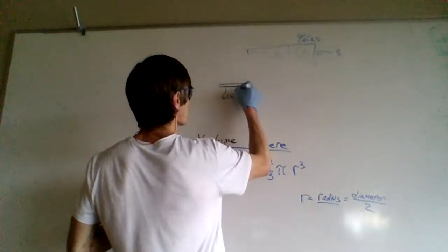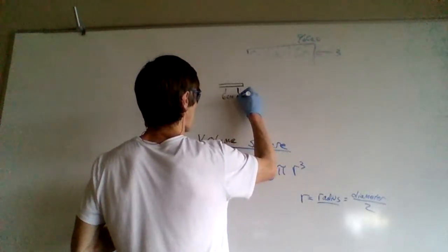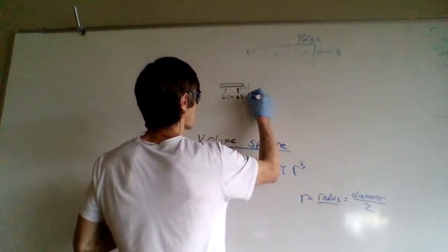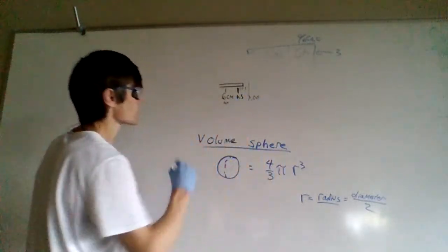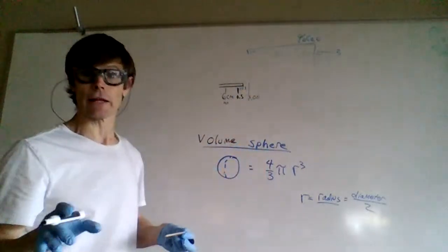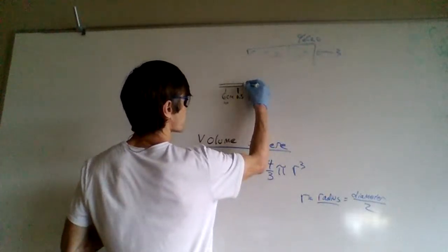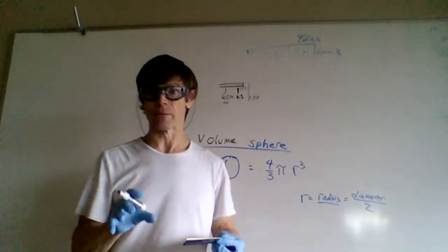This was 6.5, and then this was 7, so this is 6. I would estimate 6.8, and I'm going to go with 6.81 centimeters.